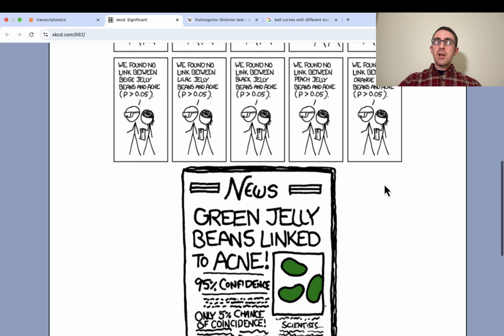It's a little bit unrealistic to use one here because in real life, it's not actually the smartest way to do this. So I didn't actually pick the KS test because it's the best way or the smartest way. I picked it because I thought it would be the simplest and the easiest way to teach this concept to you guys.